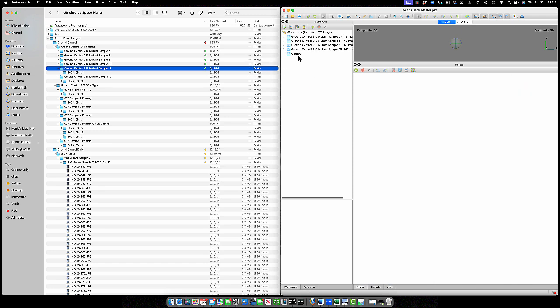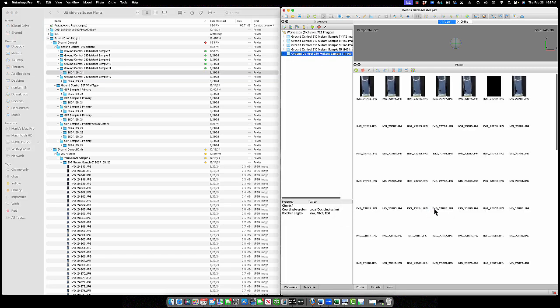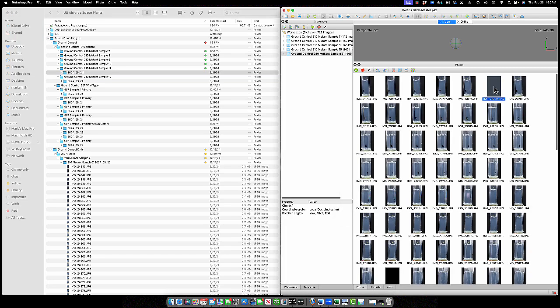So basically what I'll do is I'll add a chunk, rename that chunk, the directory name, pull in the image data, press OK, and inspect. You can see here, this is an image where the flash didn't fire, so we're just going to get rid of that.